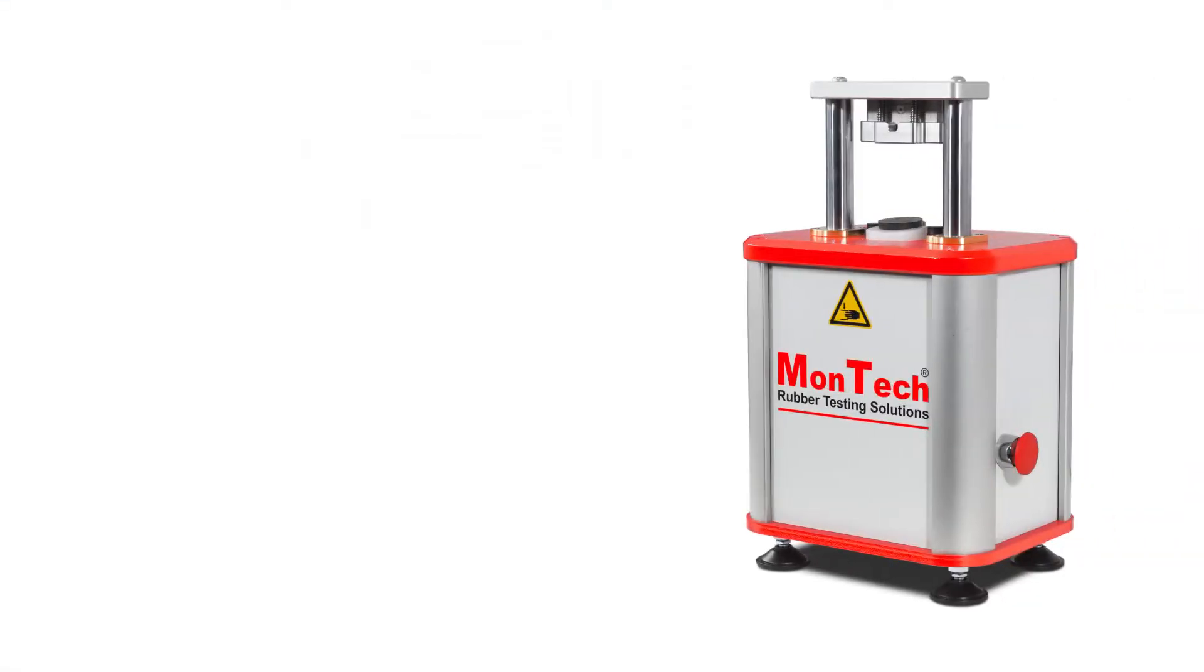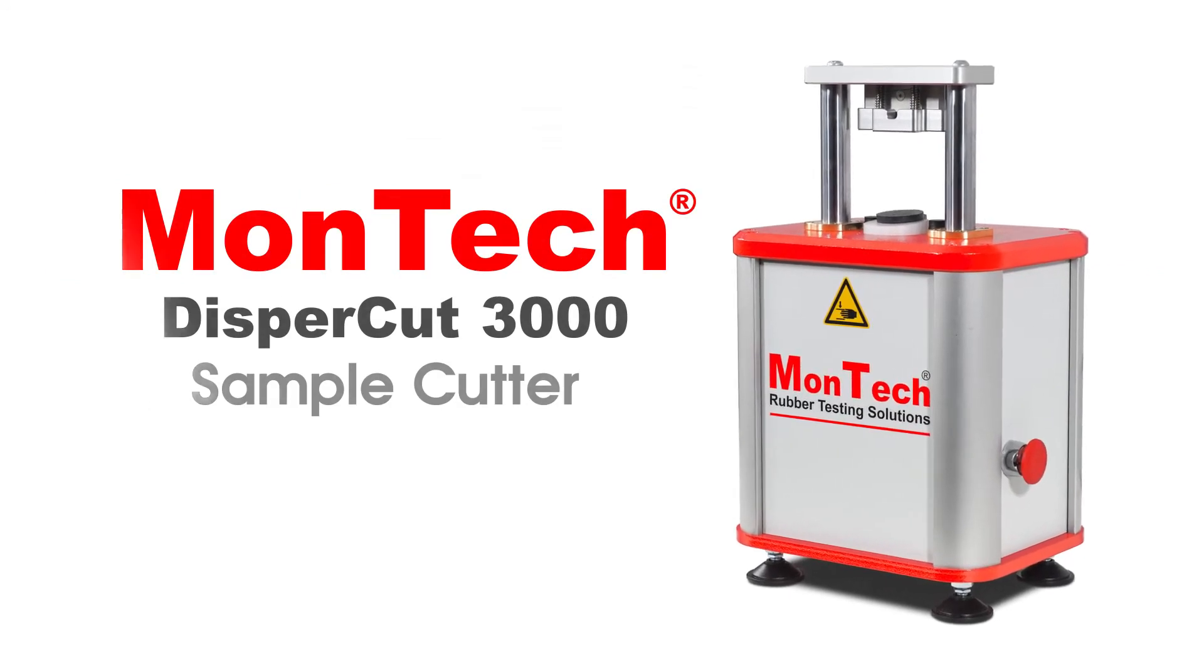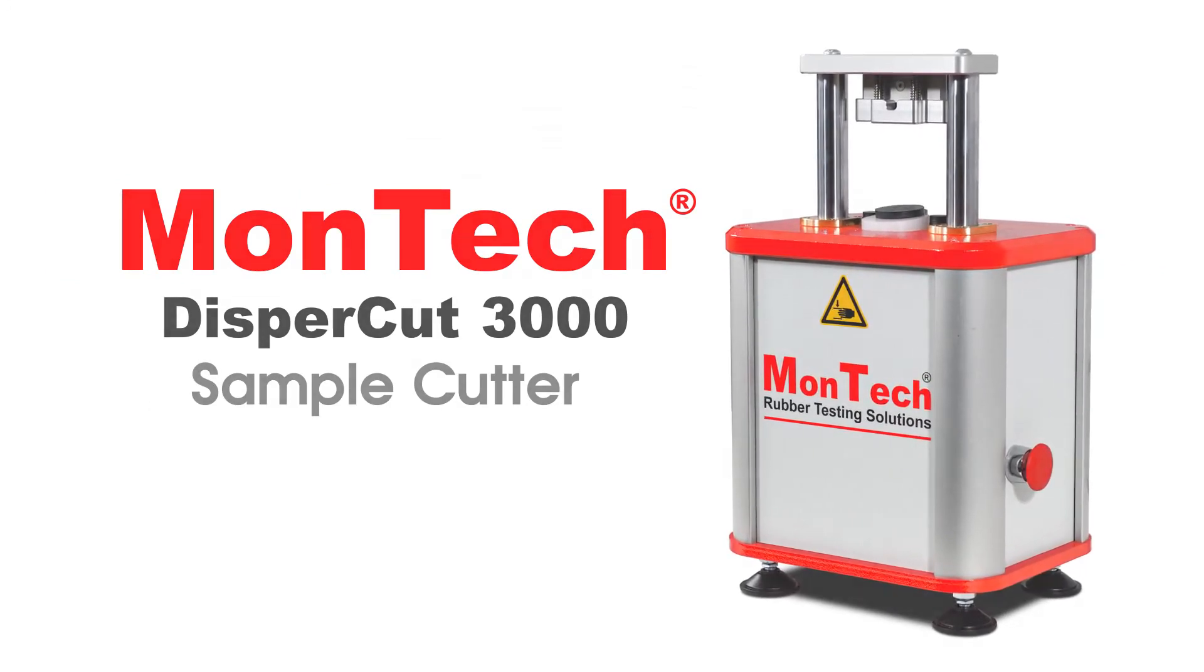For quick and reliable dispersion testing sample preparation, the Montec DisperCut 3000 is the perfect choice. Contact us or visit our website for more information.